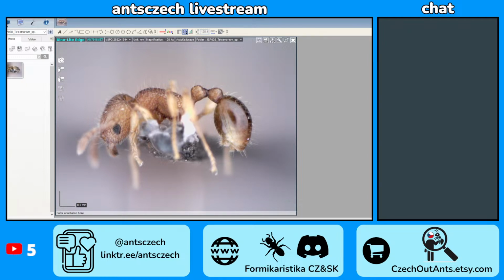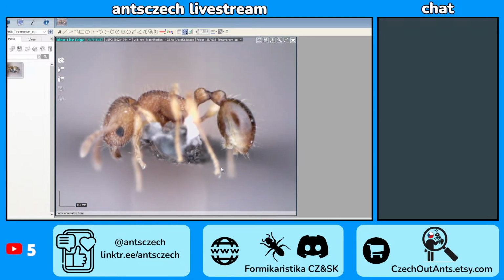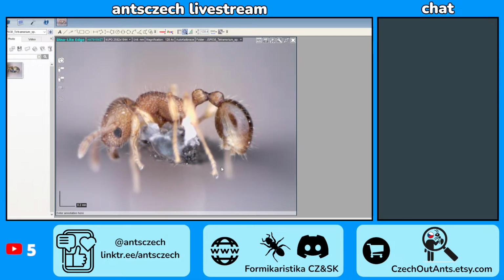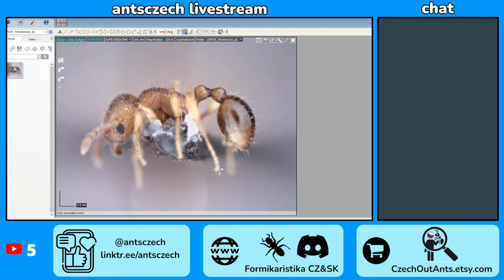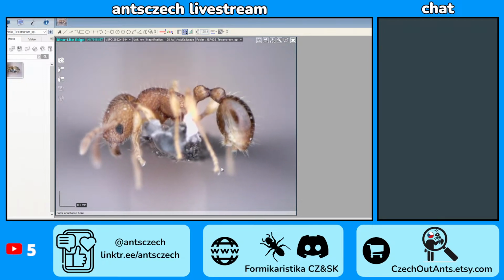The main species I have to look at is this Tetramorium, because the Carebara was there by accident. The person who collected it didn't even know that there was a mixed species inside it, and it was collected on the curculigo plant.